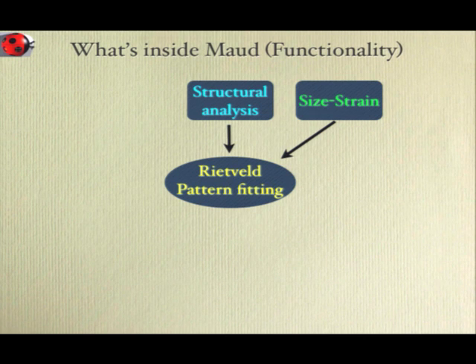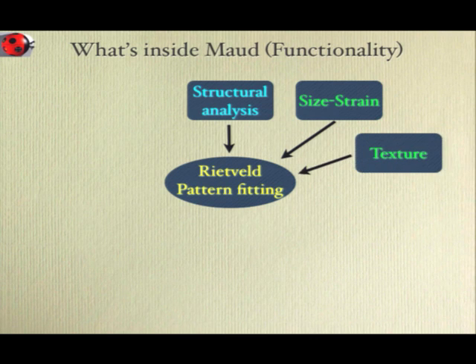So sometimes your sample or your structure you can characterize better by charge flipping, sometimes by direct methods. So the idea is that you also want to test different methods and see which one is more suitable for the kind of analysis you are doing. I said mainly for me, but actually there are very few people who have written a plugin for MAUD to extend the functionality.